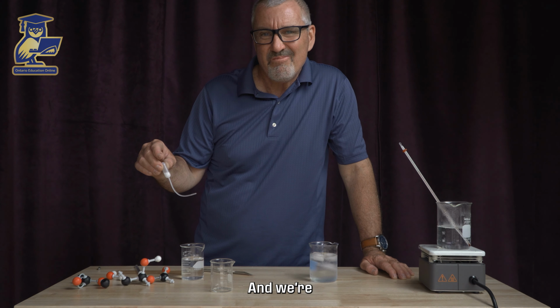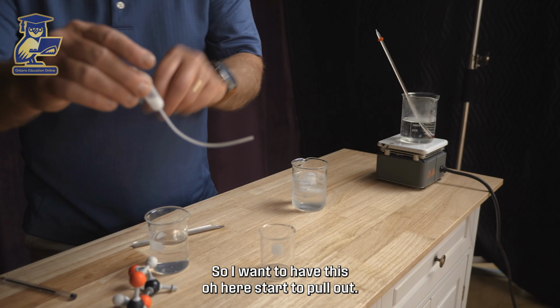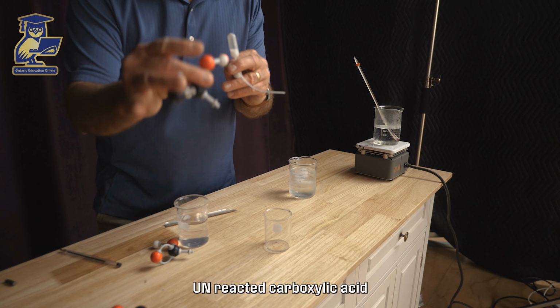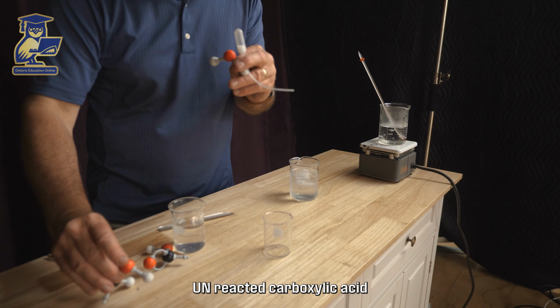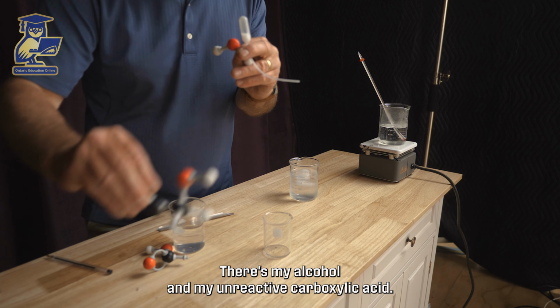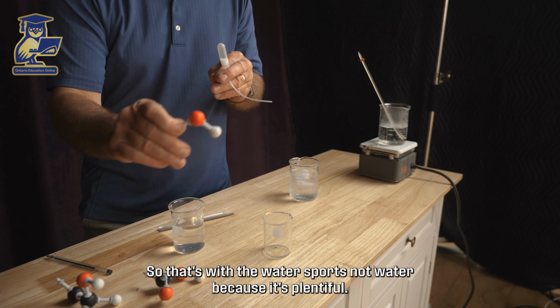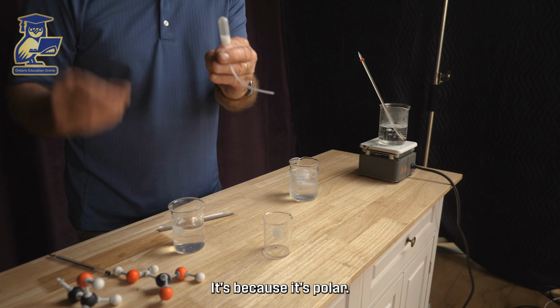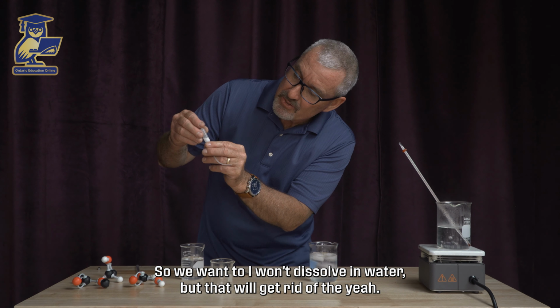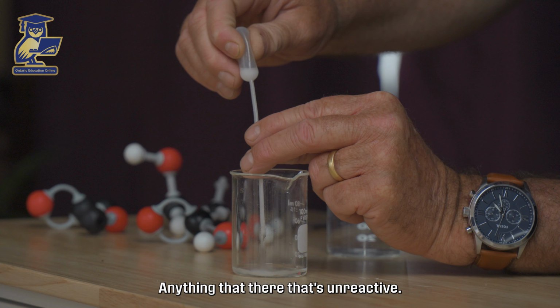And let the water act on it and have that OH of the water. So I want to have this OH here start to pull out unreacted alcohol and unreacted carboxylic acid. So that's what the water's for. It's not used because it's plentiful, it's because it's polar, all right? The ester won't dissolve in water, but the water will get rid of anything that's unreacted.